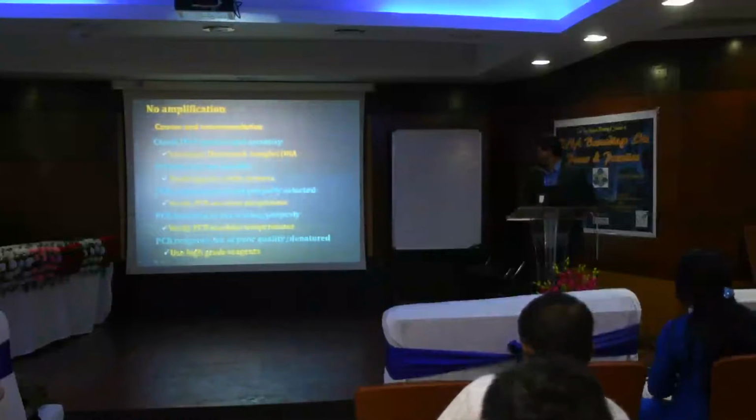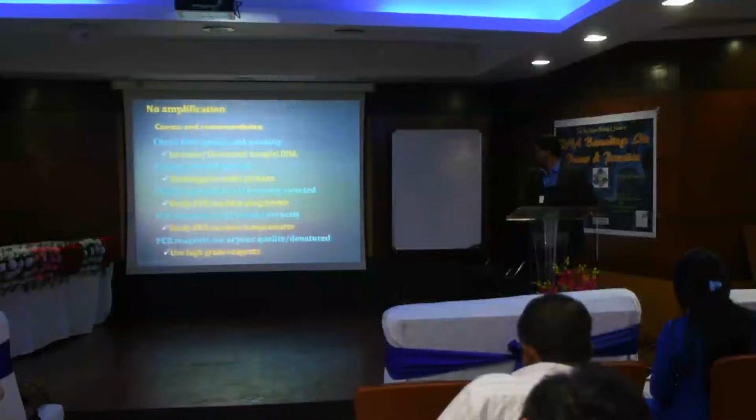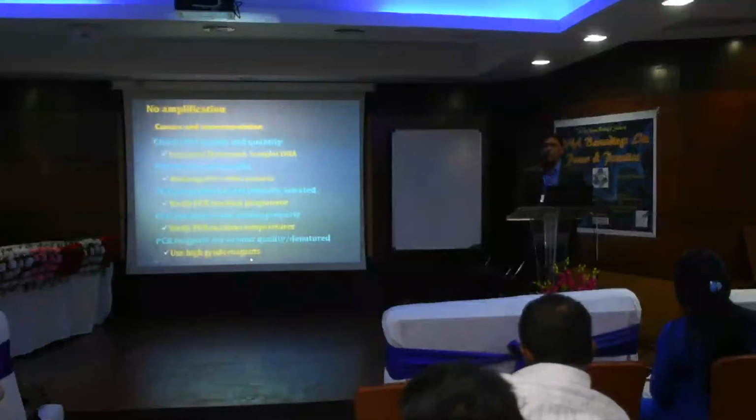Then verify PCR machine temperatures also. Check that PCR reagents are of proper quality and not denatured. Always use high grade PCR reagents.